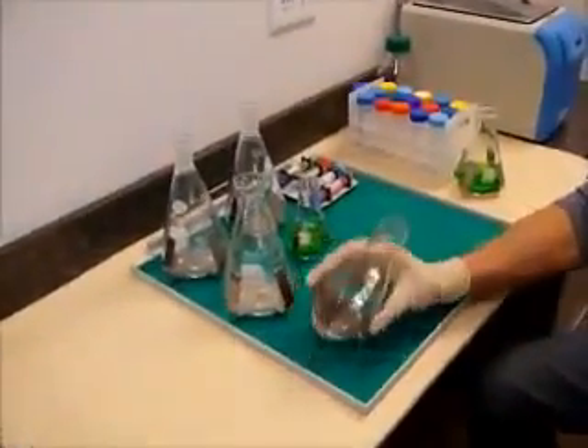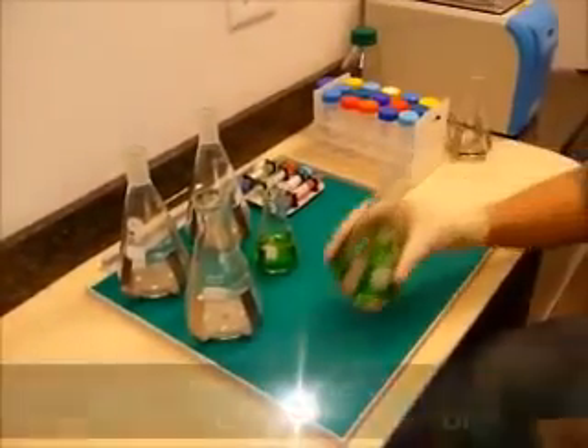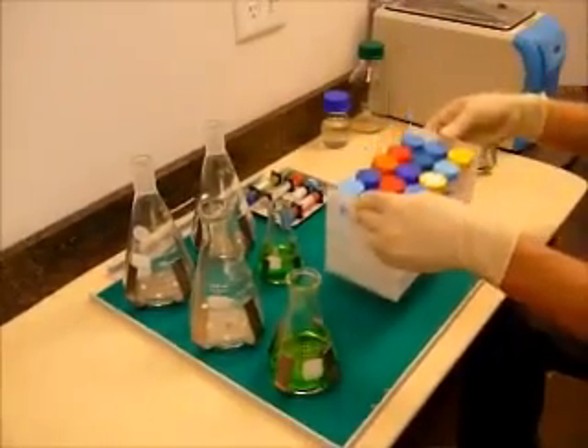With the new Magic Clamp Platform from Benchmark, clamp exchange is simple, instantaneous and tool-less. Just remove and attach clamps by hand, utilizing the patent-pending magnetic system.